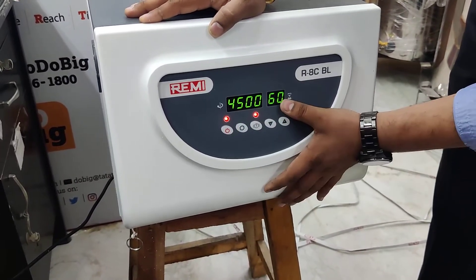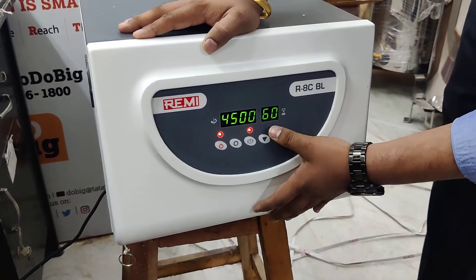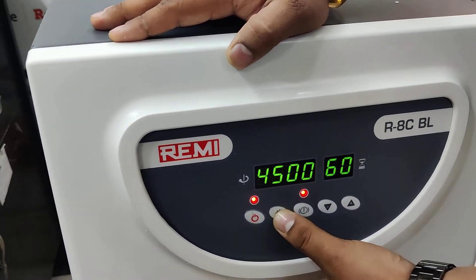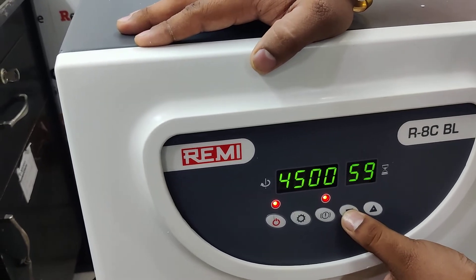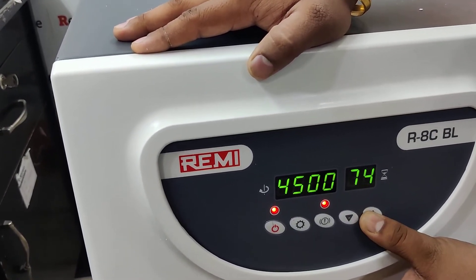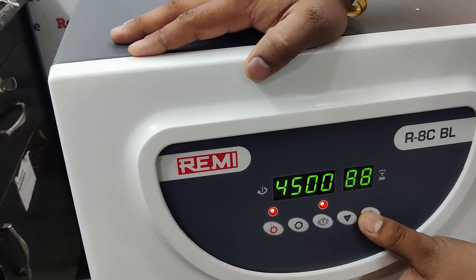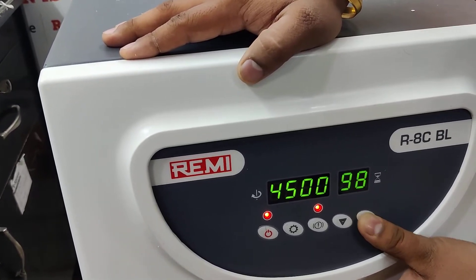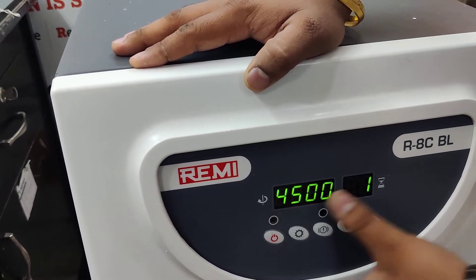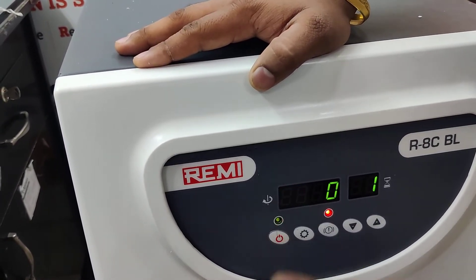Once I have set the RPM at 4500, I will again click on the settings button. The timer indicator will start blinking. Once it is blinking, I will set it to one minute. Once these two are configured, I will click on the start button.